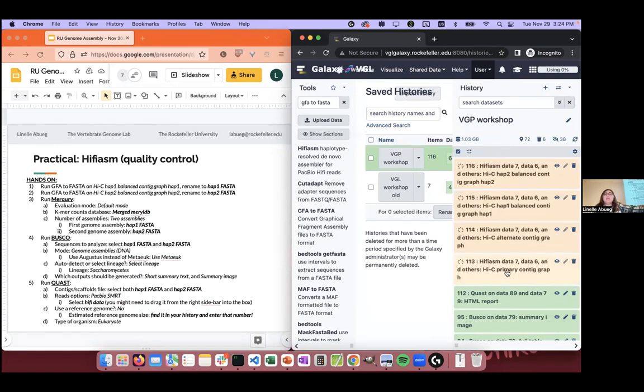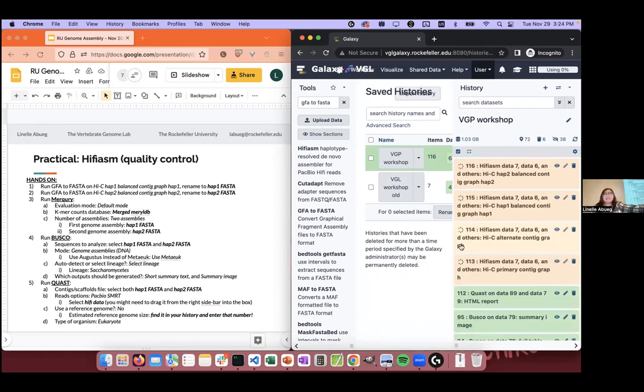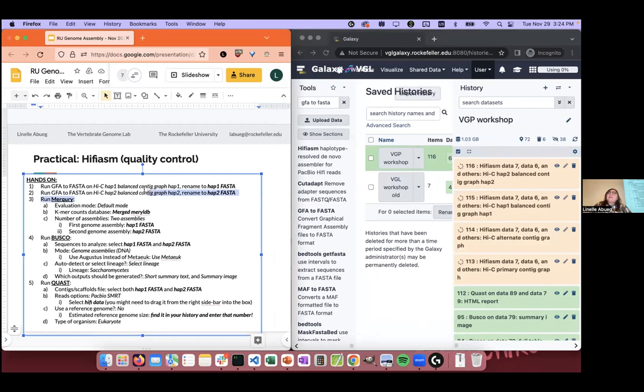It's still running, but I'm just going to show you, we can queue up the jobs while it's running. Like we can tell it to use this as an input, even though that job is still running. So we're just going to do that so that it will be more timely. I'm going to modify it a bit from here because you can't rename a job until it's finished, but you can still put it as an input. So we'll just do our best here.